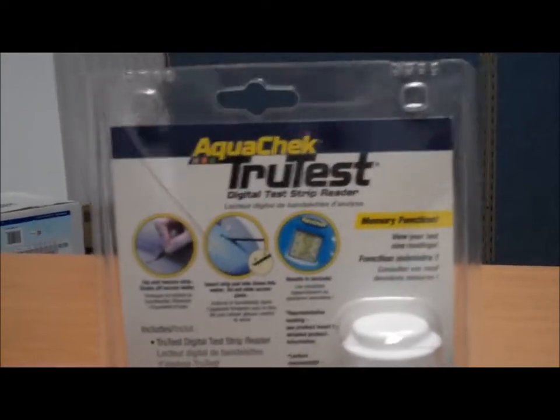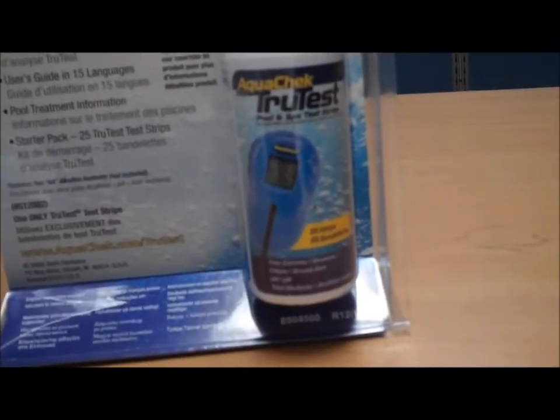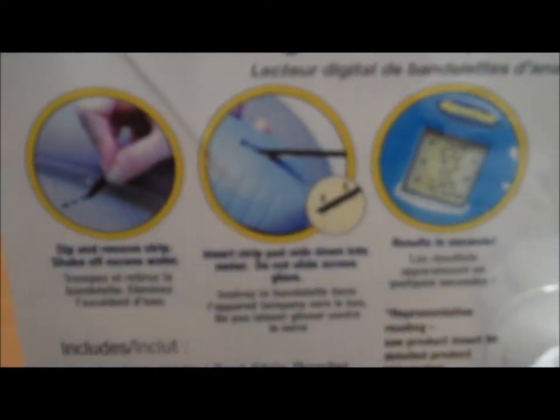Included in the digital test strip reader by AquaCheck is a starter kit of 25 test strips. The digital reader works with almost any AquaCheck test strip. Simply dip it like you normally would, insert the strip into the reader, and read the readings.